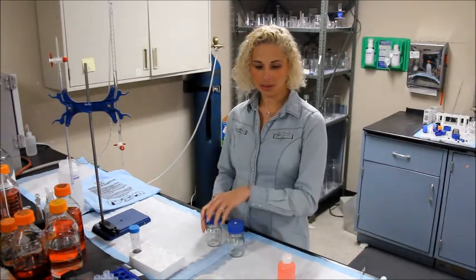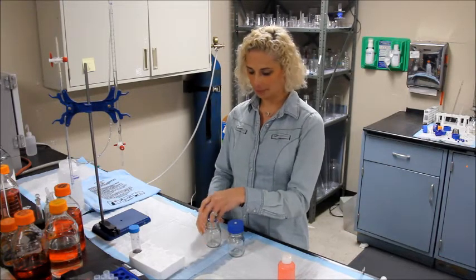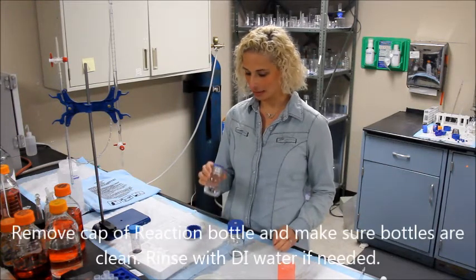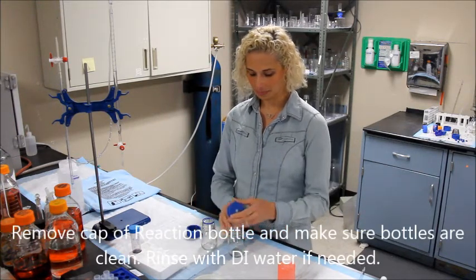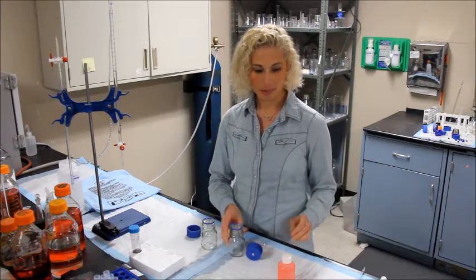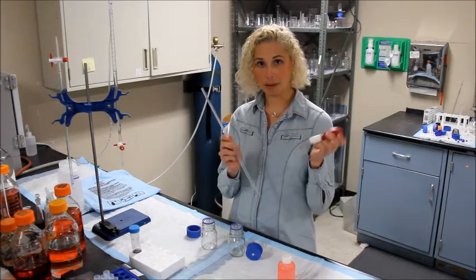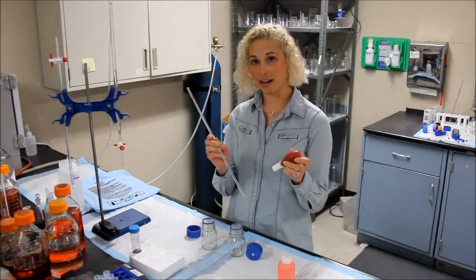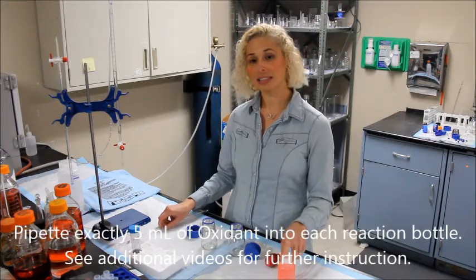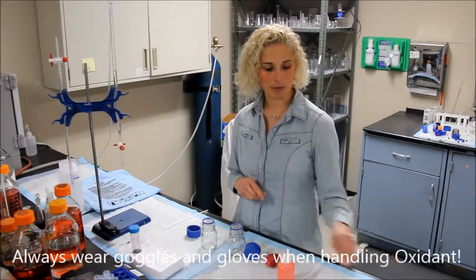To begin, remove the cap from each reaction bottle used. Inspect each bottle to make sure they are clean before the assay. With the 5 ml volumetric pipette and pipette bulb, you will pipette exactly 5 ml into each reaction bottle. The oxidant is corrosive, so make sure you wear protective gear before handling.